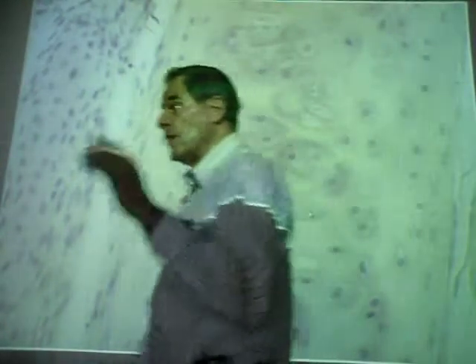Something else you should see in the wall or recognize. This stuff right here, what is this? That is cartilage, and it's hyaline cartilage with one exception. We have hyaline cartilage in the respiratory passageways, i.e. the larynx, okay? We find it in the trachea. We find it in the primary, secondary, and tertiary bronchi. All hyaline cartilage. What's the exception? Bronchioles. Bronchioles have no cartilage.